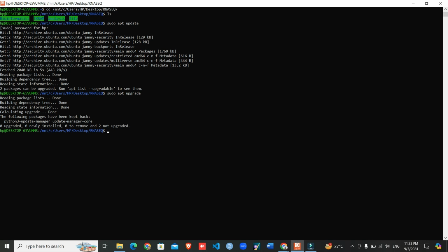How to install? sudo apt install sra-toolkit. I have already installed it, so you can install it by this command.